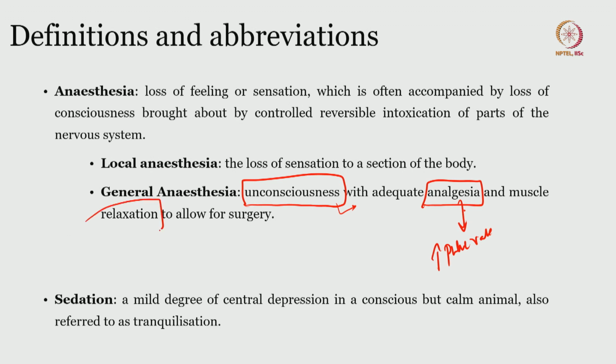Another important component is that there is enough relaxation to allow for surgery, that is, muscle relaxation. Muscle relaxation in rodent surgery is not really a big deal except for spinal surgeries.